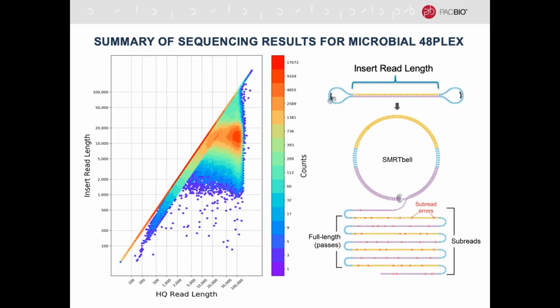That tells you that the fragment sizes are most highly concentrated between 10 and 20 kb. And you can see that we've made many passes on these, getting up to 20 kb, up to 50 kb and above on the total polymerase read length. So that tells us that we have multiple passes over these 10 kb inserts, which is a nice thing.